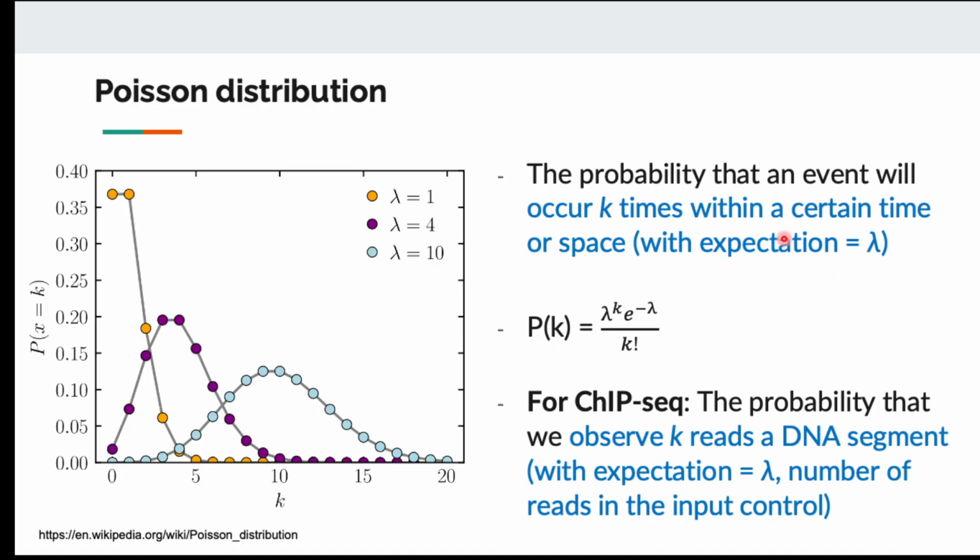So this is your expectation. If your ChIP-seq is the same as your control, like there is no transcription factor binding, and in your control you see 10 reads, you should expect to see 10 reads in your ChIP-seq. The fact that you see 100 reads, which is much higher, is evidence that you are probably enriching for transcription factor binding in this area.